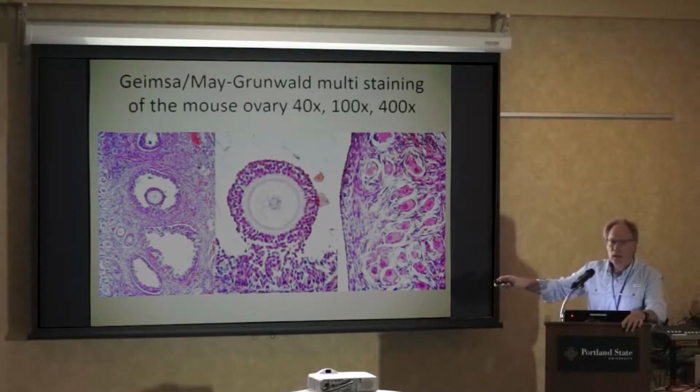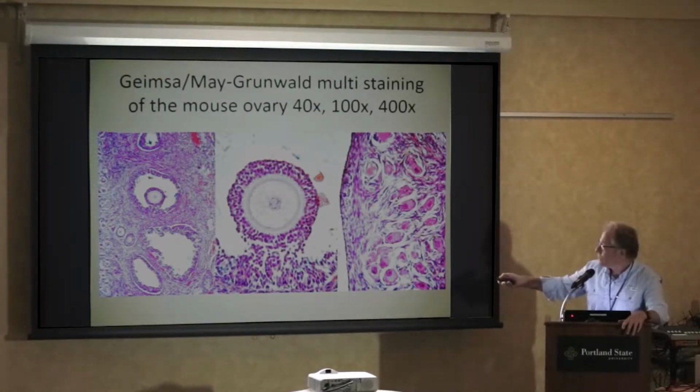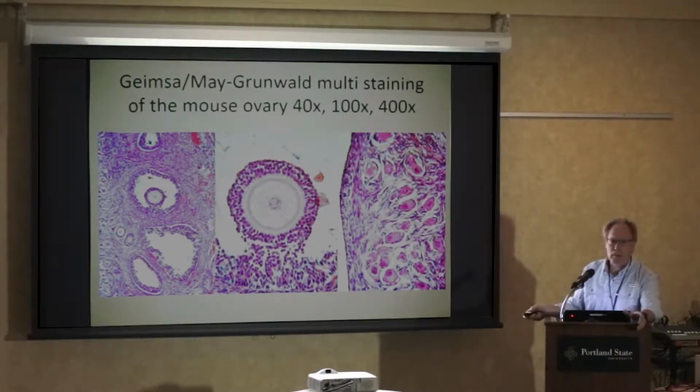And it's bringing it up on higher magnification, but this gave me much better resolution, much better distinction, visual data than any of the other individual stains. So this is the oocyte as it develops. You can see the zona pellucida clearly around there, this follicle cell layer that is, again, dividing very, very rapidly, shows up, I think, because of the Giemsa stain. The additional follicle cell layer that's going to be all around the outside that is making the estrogen, also dividing very, very rapidly. So I think the Giemsa really brings that out.